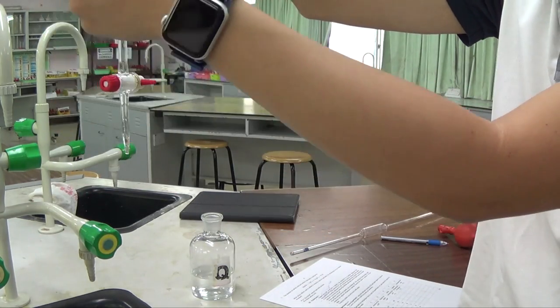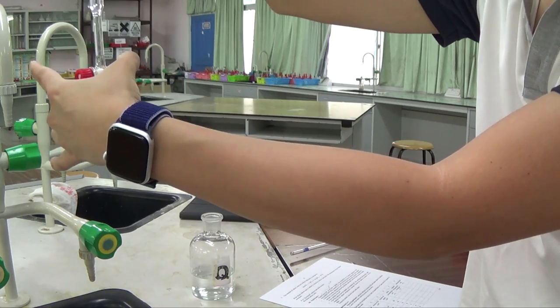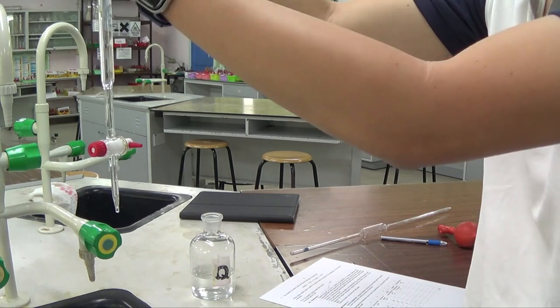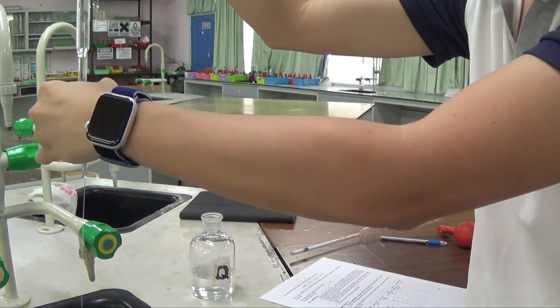I open the tap all the way and everything flows out. At the moment, the bit at the bottom was what I rinsed through. So I need to open the tap again in order to allow this solution, which is a clean portion that I just added in after I rinsed it, to flow. Okay, then I close the tap.